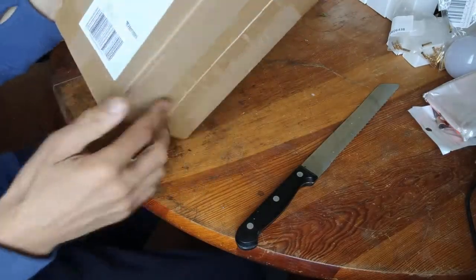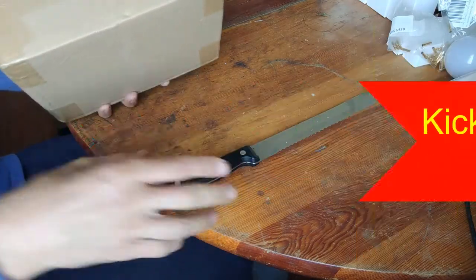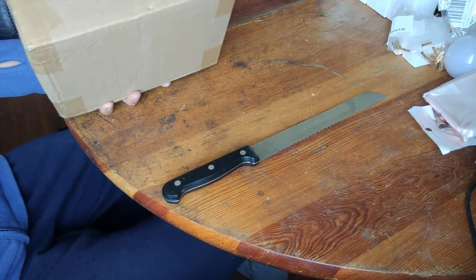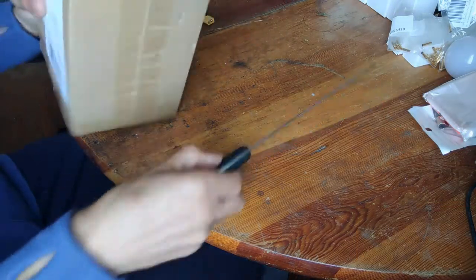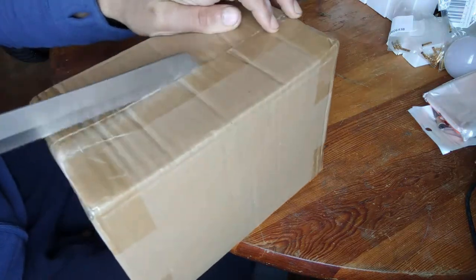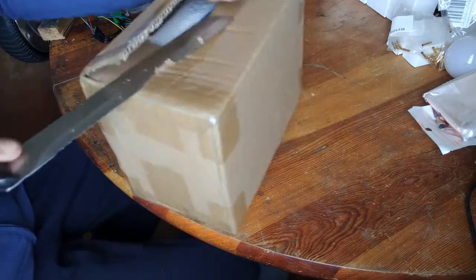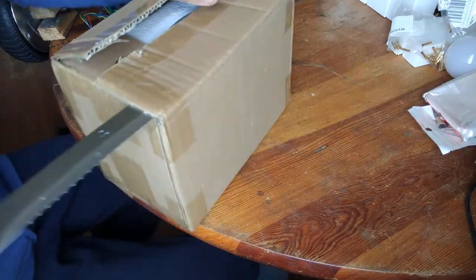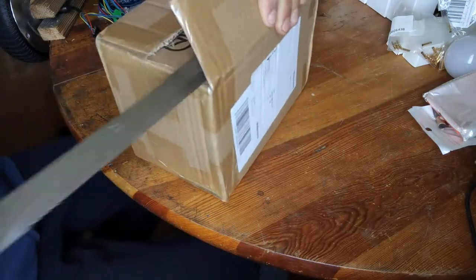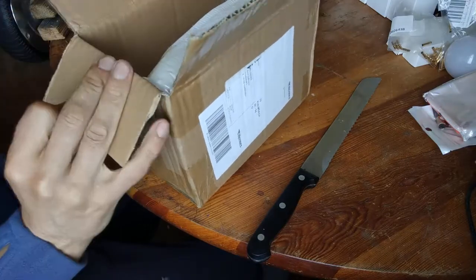Unboxing — it's delivered by Hermes to Germany, and there's no tax invoice, which is very nice from the creator. They chose a shipping method where the carrier did not add any handling fee or extra charges.